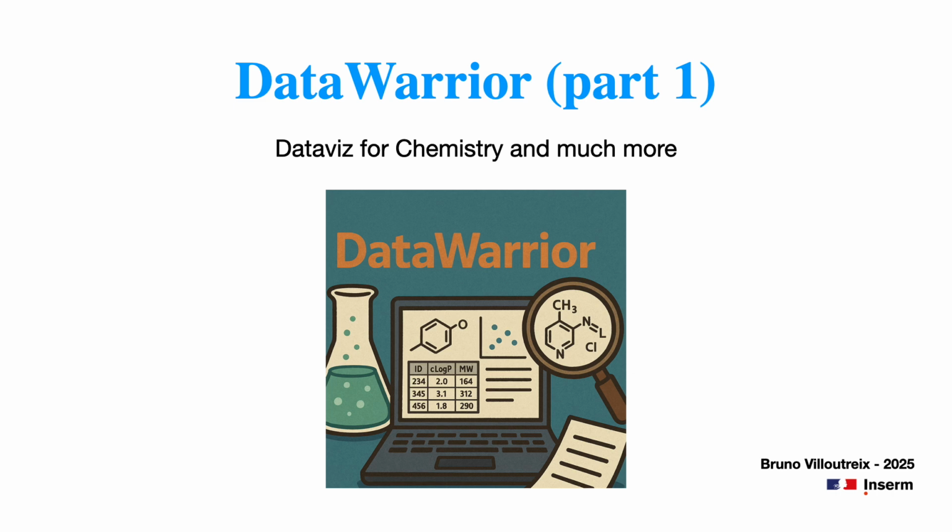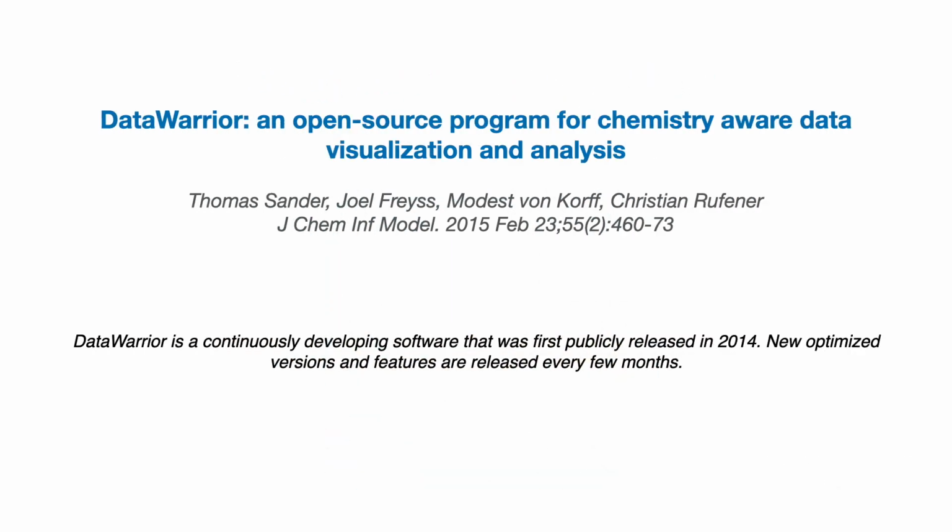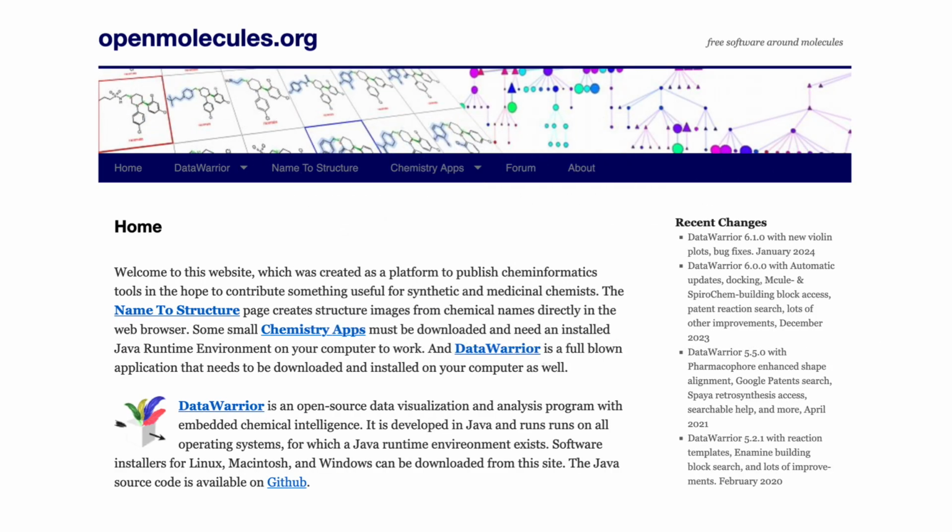This first presentation offers an initial glimpse into DataWarrior's potential. I will be uploading a series of tutorials to explore various functionalities packed within this powerful tool. DataWarrior is a continuously developing software that was first publicly released in 2014. New optimized versions and features are released every few months.